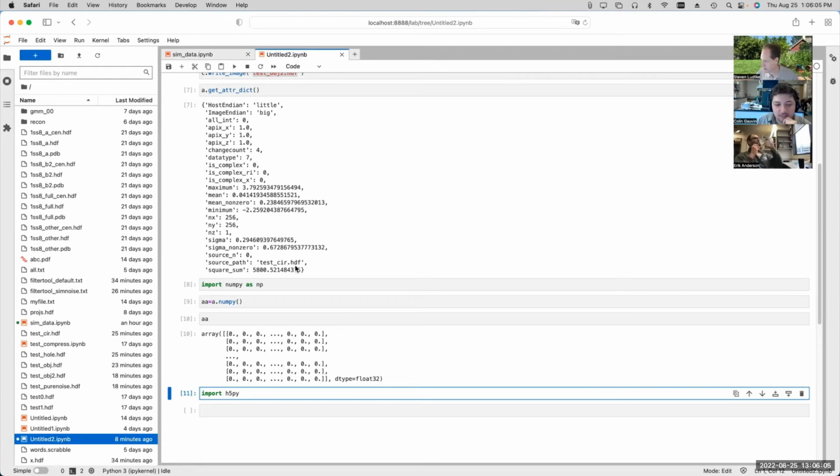Yeah. You can also run into issues where for a number of years, for example, David Mastronarde had misread, well, you could blame it on him or you could blame it on the people who wrote the standard, but there was a disagreement about whether 8-bit data should be stored as signed or unsigned values in the file.